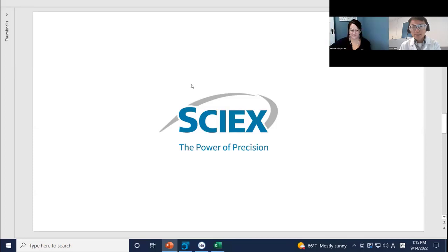So I will hand the time to Paula for our first Q&A. All right, Jungwei, I've got a couple of questions for you, and I'll take this opportunity to remind everybody, please feel free to send us any questions that you have. We will have 2 more breaks, I think, for questions before we close out for the day. So plenty of opportunities to get your questions answered. So to start, Jungwei, can you use EAD with MS1 only?